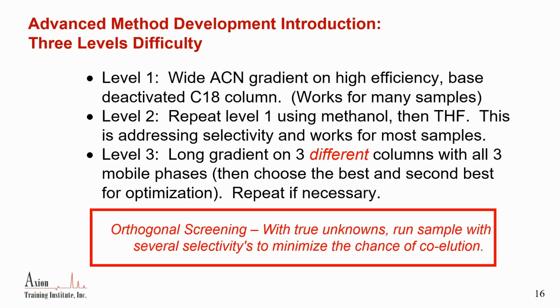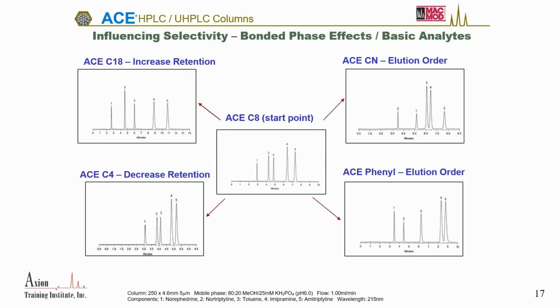I look at this as experimental design. I want 3 different stationary phases, and I want to run them with 3 different mobile phases and really generate a lot of data before I make the next decision. So this is something that, it's fun. It's a talk I've given a million times. It gets good, people seem to like it, but I always stop there, like, oh, and if it doesn't work for you, try a different column. But now it's time to talk about those different columns.